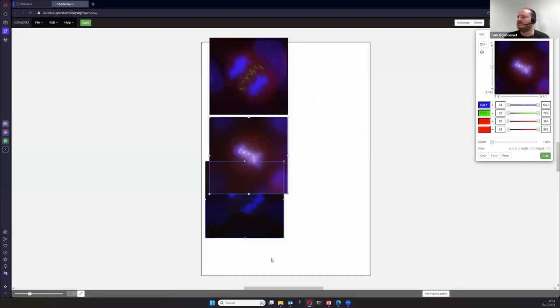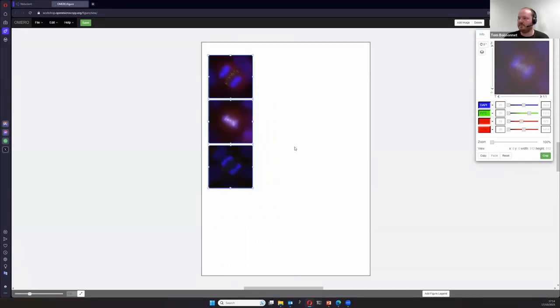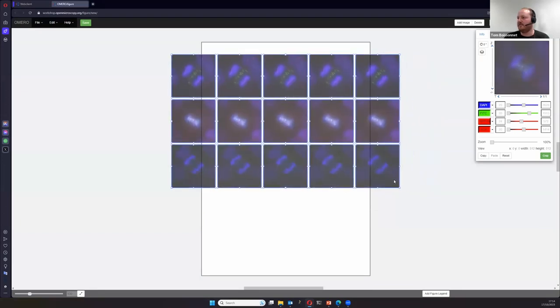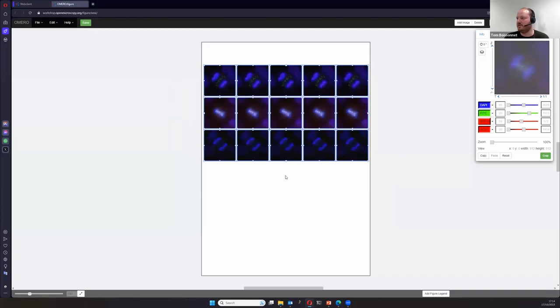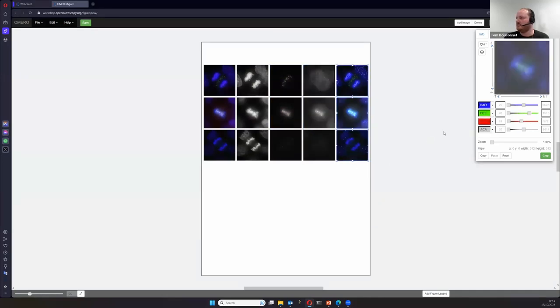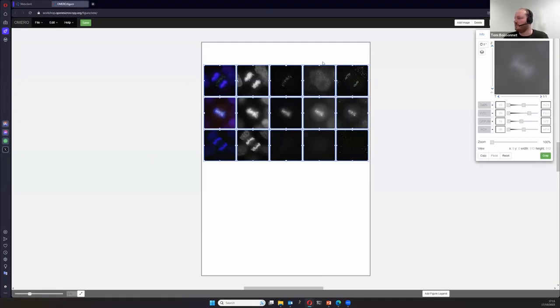I'm going to select the images together, reshape them to fit inside my canvas, use a tool to align them to a grid. I'll show a specific channel, use Ctrl+C and Ctrl+V to duplicate them, fitting them all on an A4 page roughly. I'll change every channel to white and disable unused channels. And there I would have all the images I want to present.